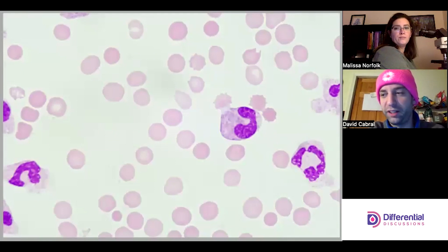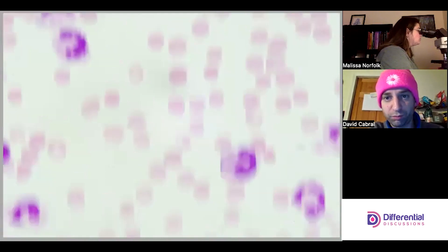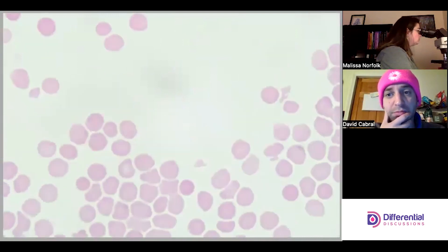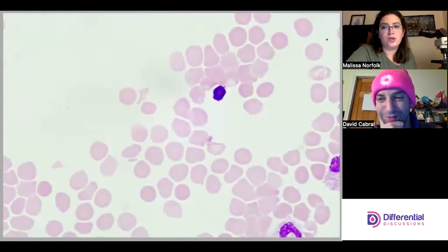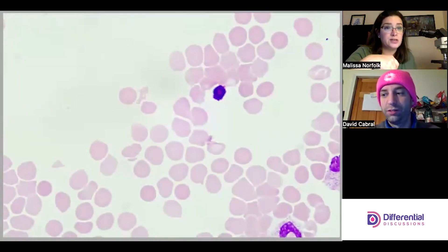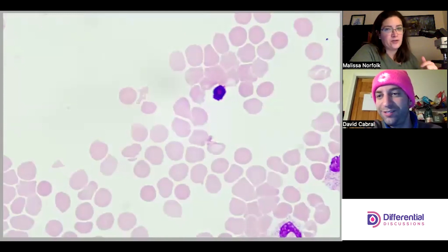Poly, poly, poly — consistent with the low power impression. There's some purple schmutz to point out. Compared to our intro differential video where we saw cryptococcus, this is just schmutz — it doesn't have that same starburst appearance. So don't expect to find exciting findings like cryptococcus on everything.